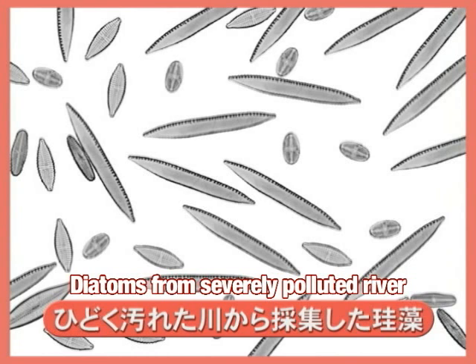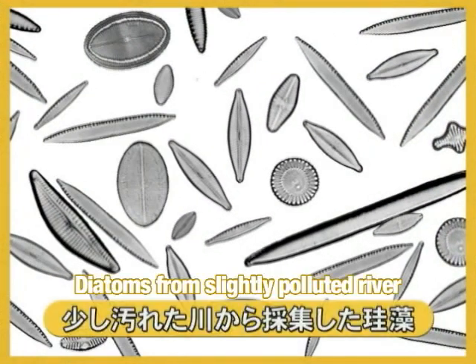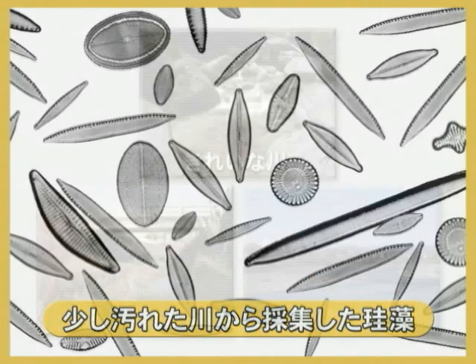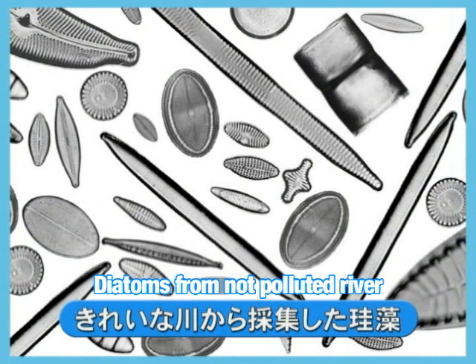There are many diatoms of the same shape in the severely polluted water. In the slightly polluted river water, oval-shaped, crescent-shaped, and other shapes of diatoms are present. And finally, the clean water diatoms — in this water exist diatoms of various sizes and shapes, and it is easy to see that many different species of diatoms live here.